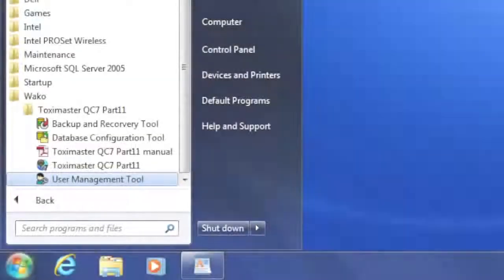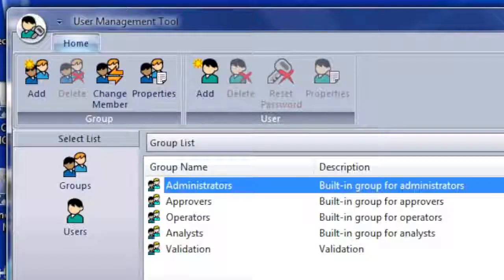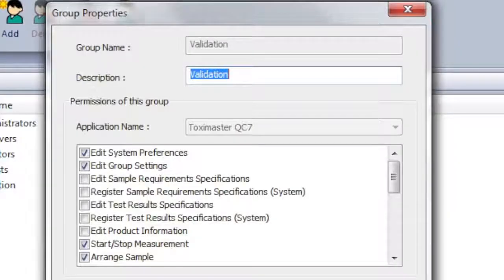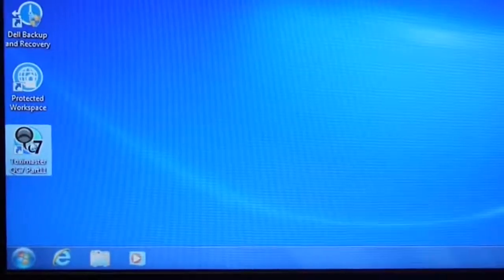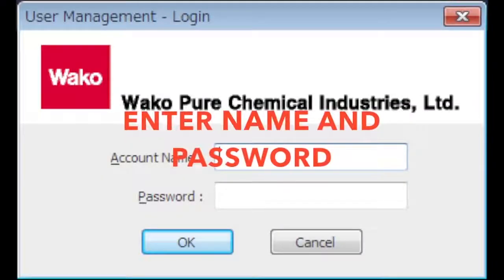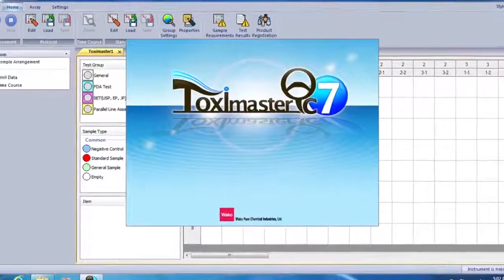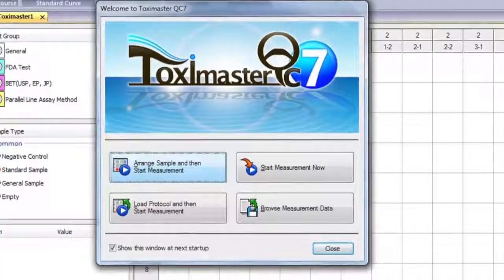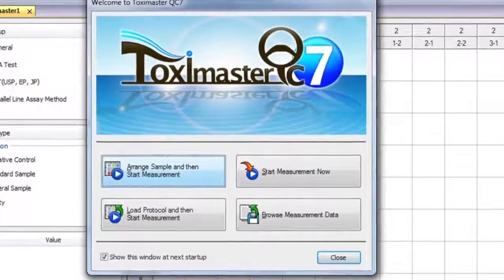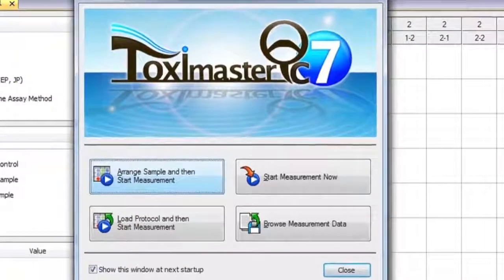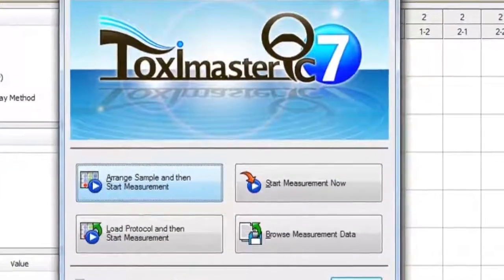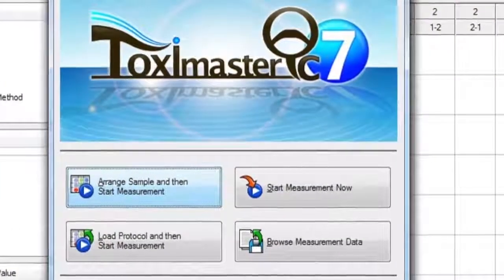The QC7 user management tool is used to control access within the Toximaster program on an individual login basis. Now, let's log in to the Toximaster program to show you how easy it is to use the ET6000. There are four options upon entering the Toximaster program. We will select Arrange Sample to show the ease of setting your protocol.